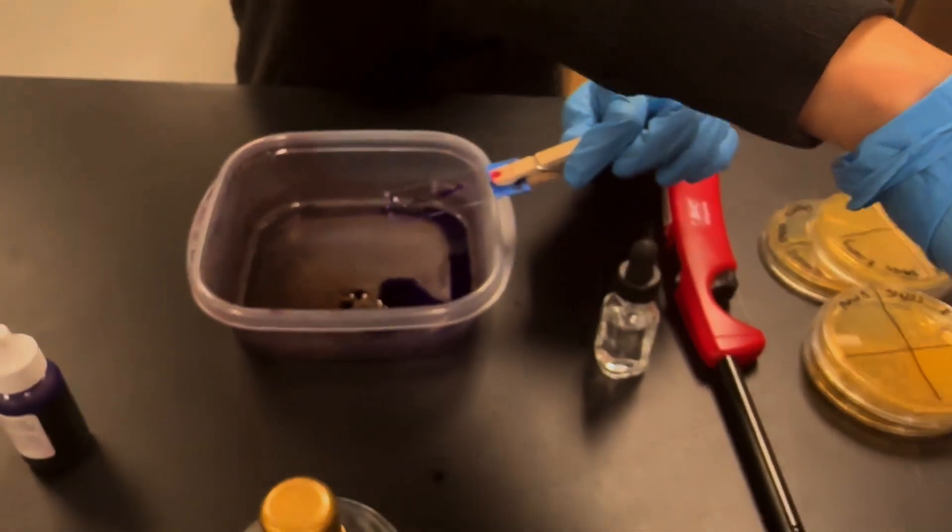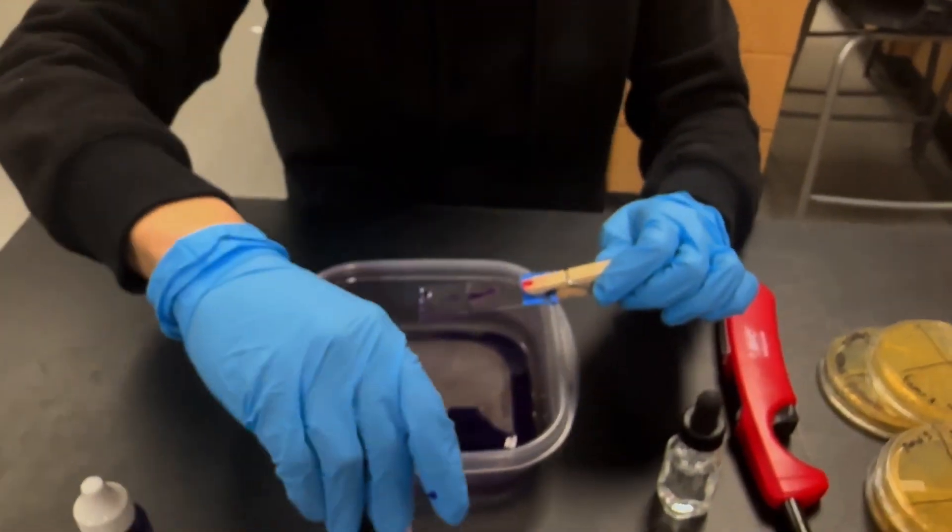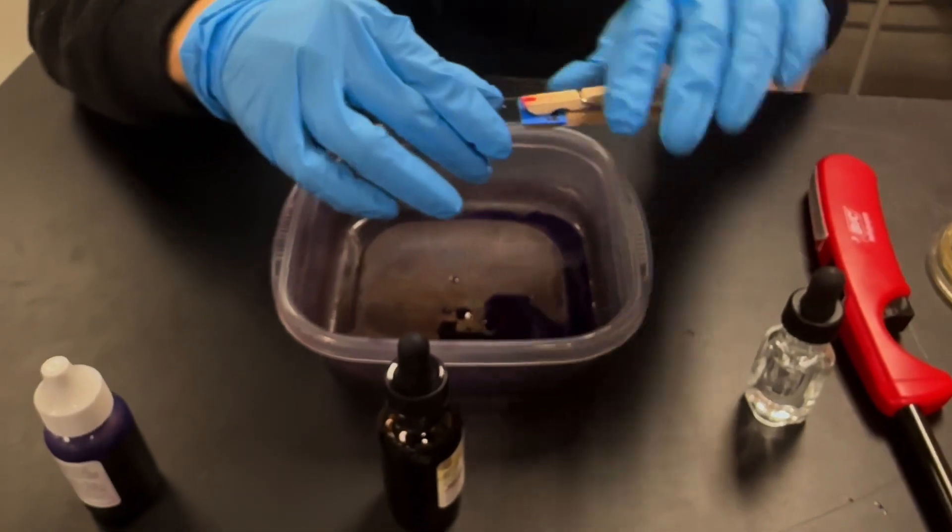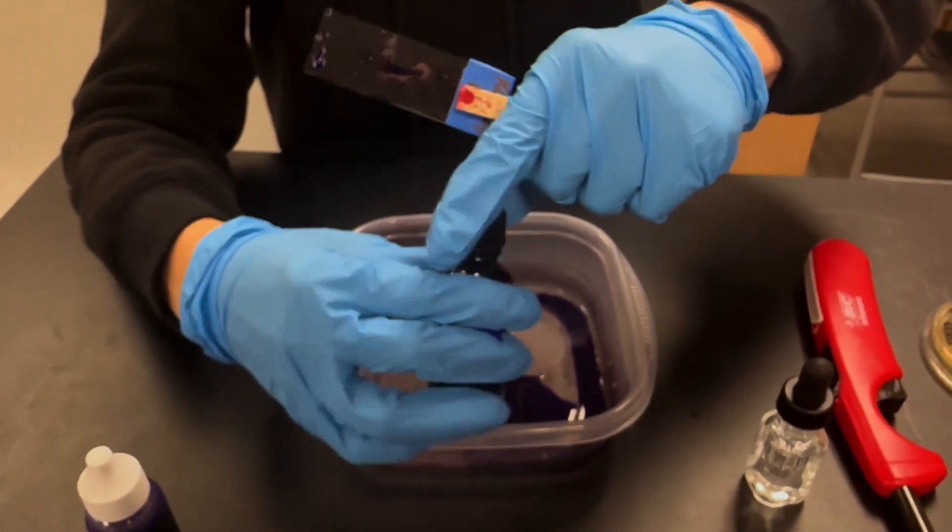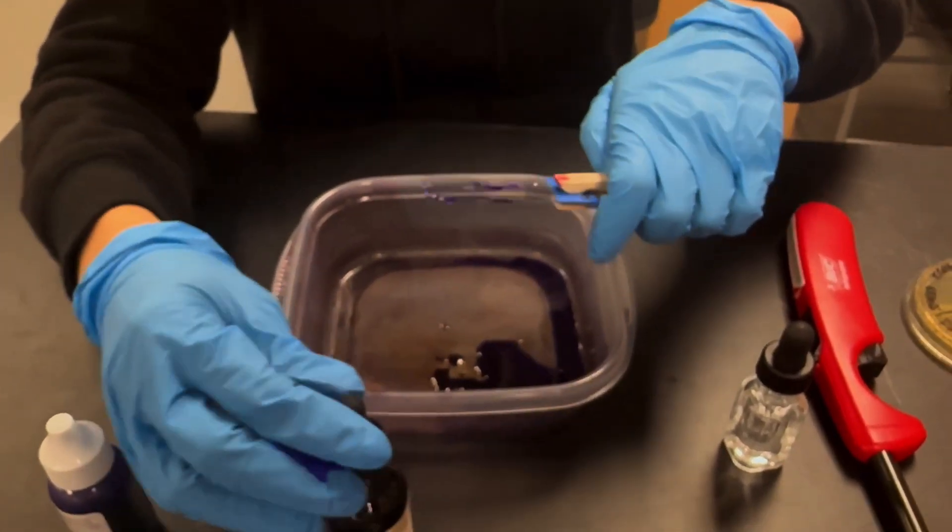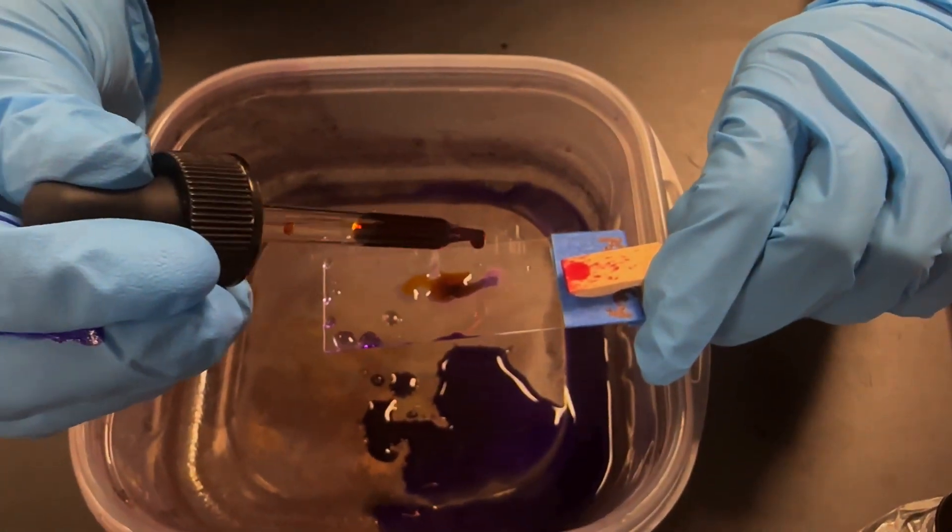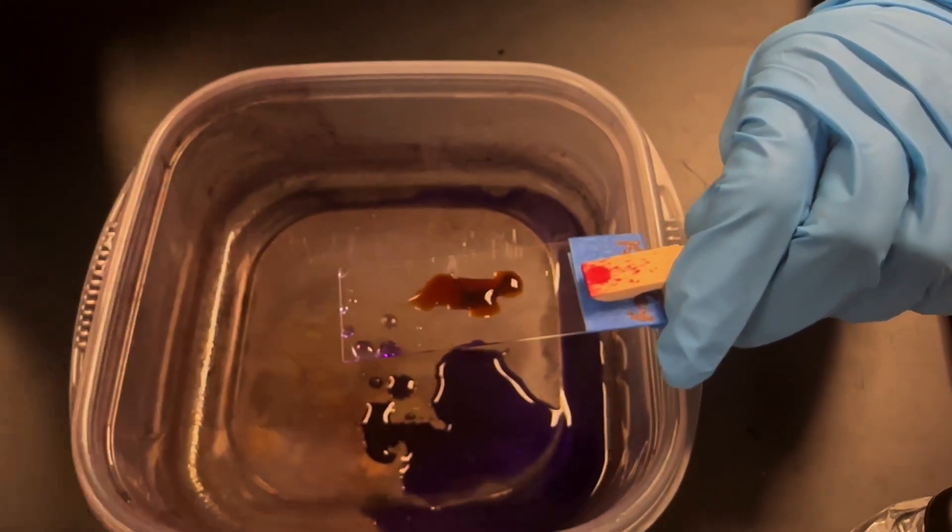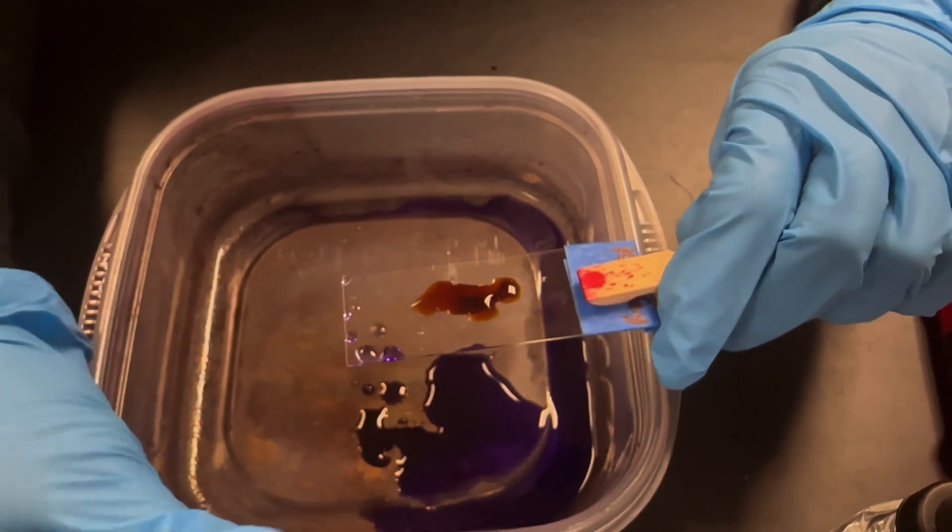So in the next step, we're going to use Gram's iodine and we'll do the same thing that we did before. So I'm going to take the Gram's iodine and I'm going to put no more than four drops, one, two, three, four, here and we'll start the timer for one minute.